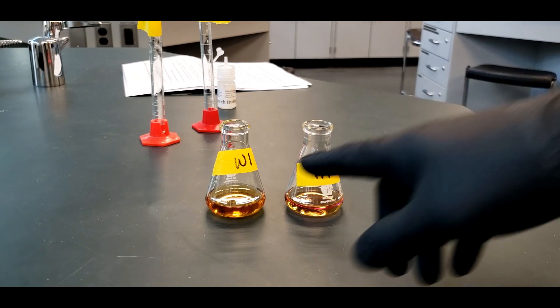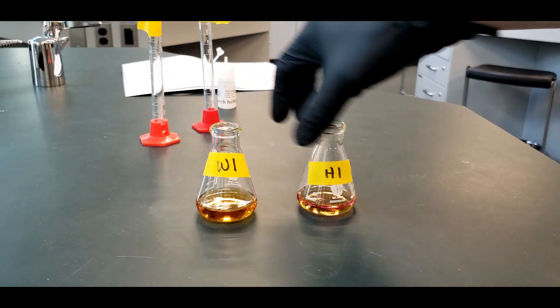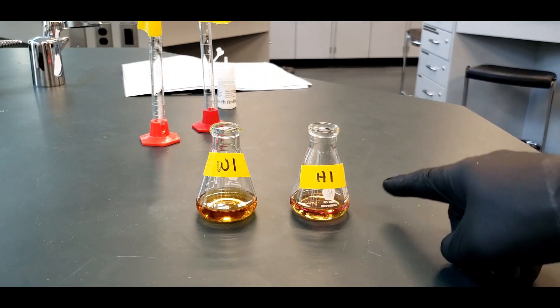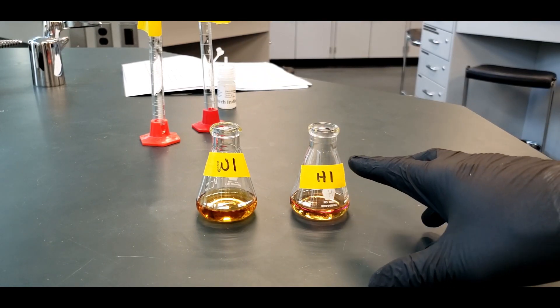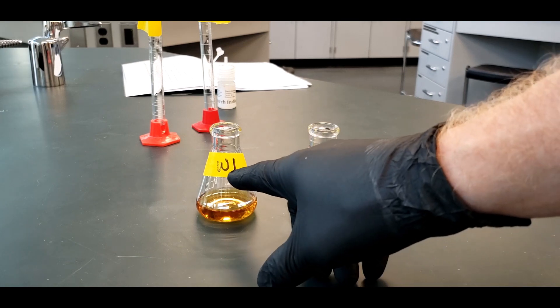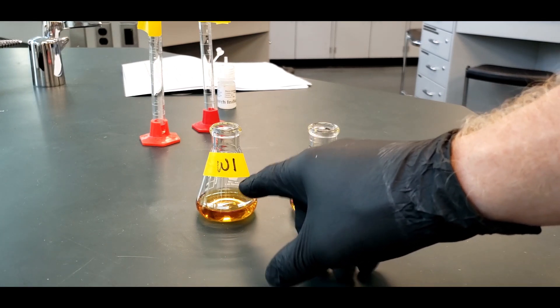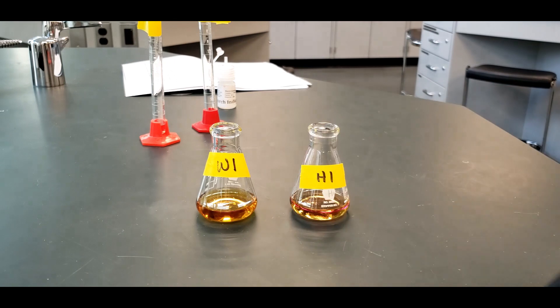So we have our samples. But we have H1 and H2 for sample A and sample B. And then we'll have the W1 and W2 for sample A and sample B. So a total of eight titrations that we're going to do.